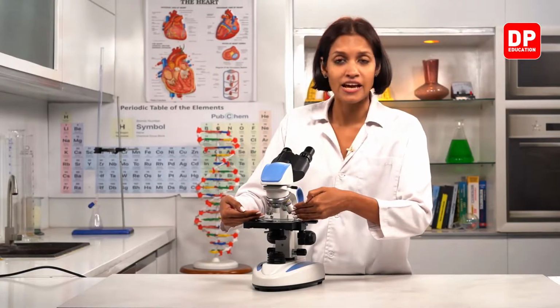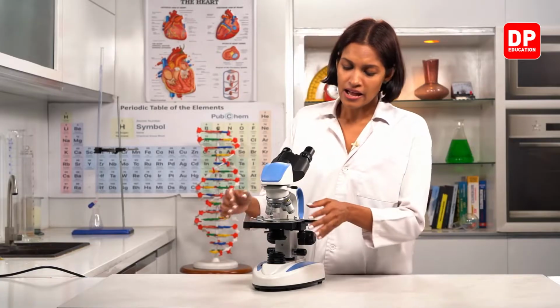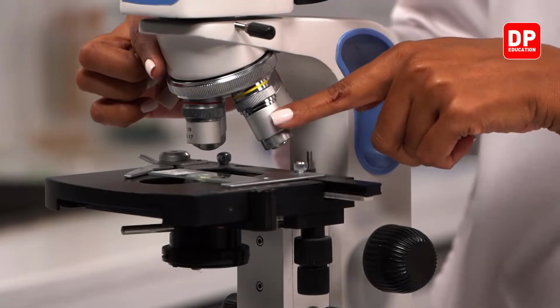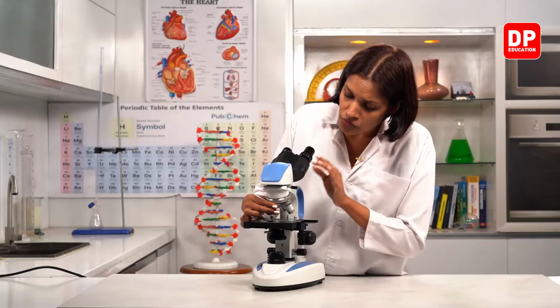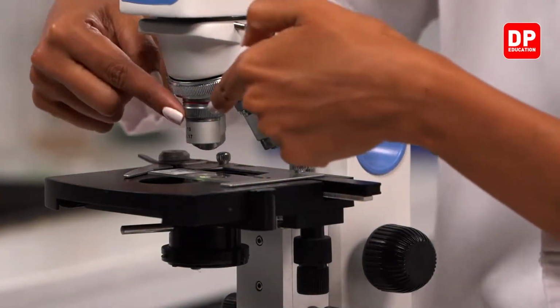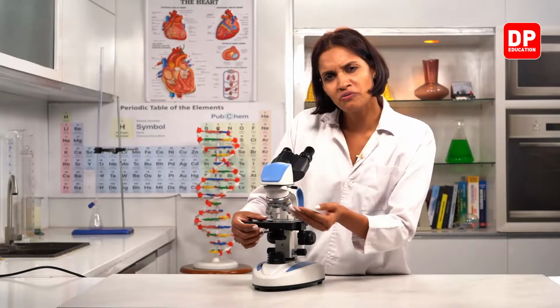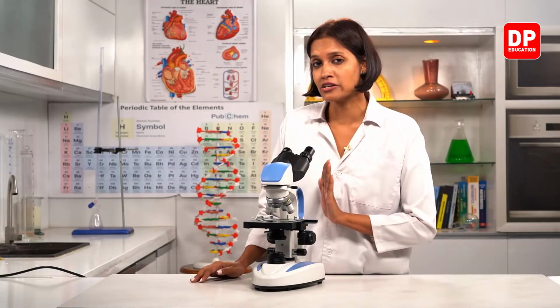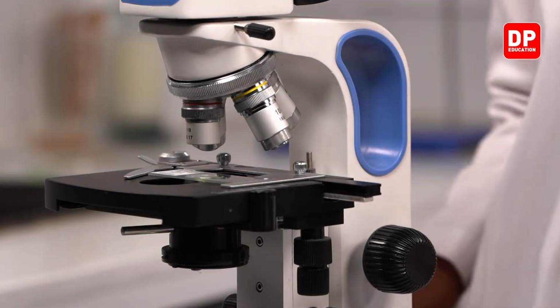Whenever we place the slide, and also when we are removing the slide, this should be done. What is the reason, children? Otherwise, now you all can see these are too long. These are longer. The other lenses are longer than this low power. So by the time we are placing this slide on the stage, if these are aligned with this one, sometimes when we are placing the slide, we might accidentally damage the lens. We have to protect the lens of the microscope. That is why always the shortest one should be aligned with the stage.